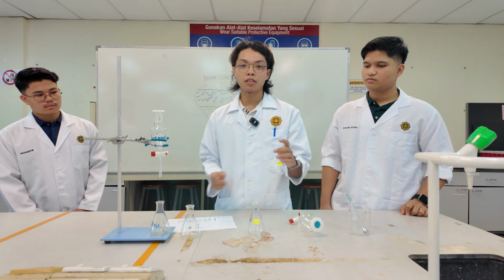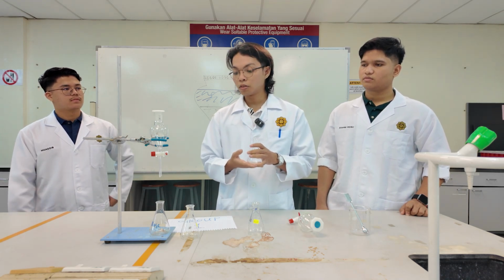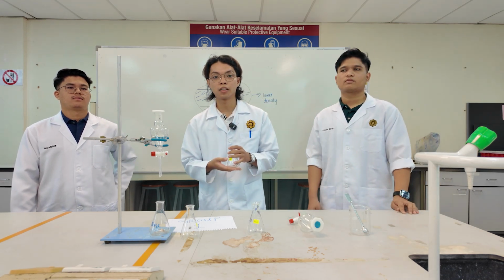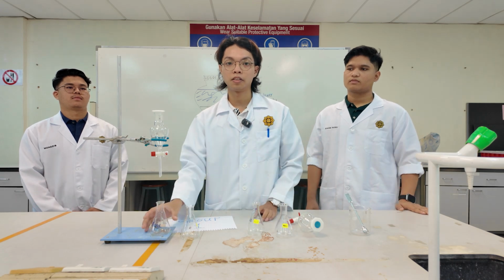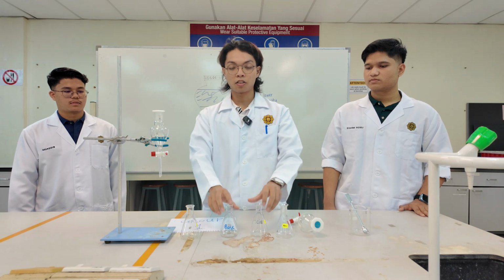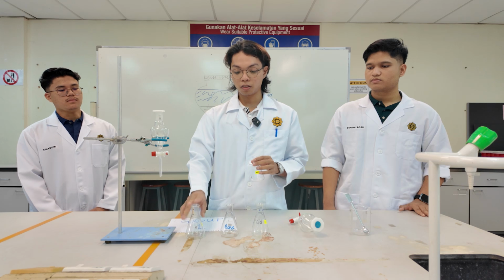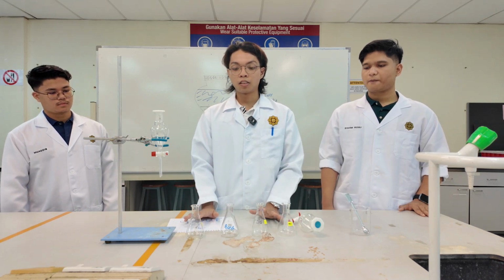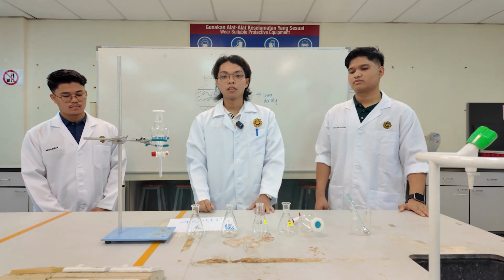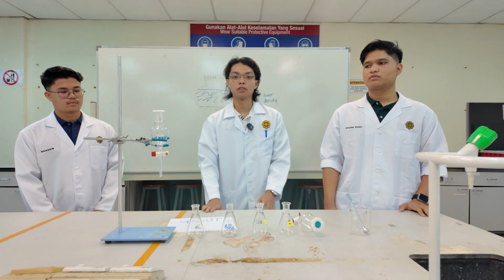And then this mixture still has a very little base, so you need to do the same step 2 or 3 times to get more accurate readings. So that's all, and then we can get the 3, because the remaining in this mixture is basically neutral only. So we already get the 3 pure substances, which are acid, base, and neutral. After that, the experiment is complete for the liquid extraction.